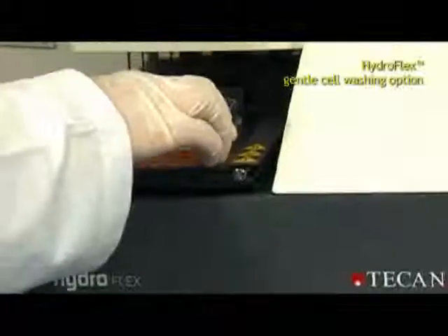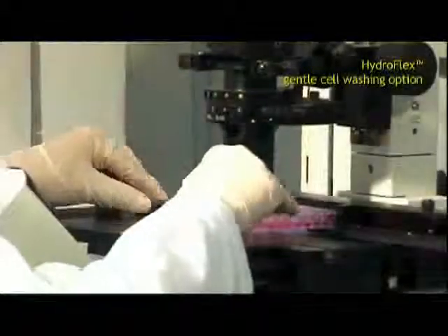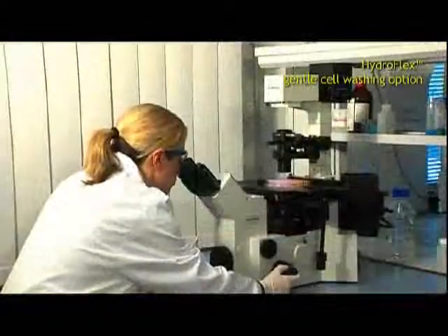Hydroflex's gentle cell wash feature leaves an intact cell layer without any visible damage.